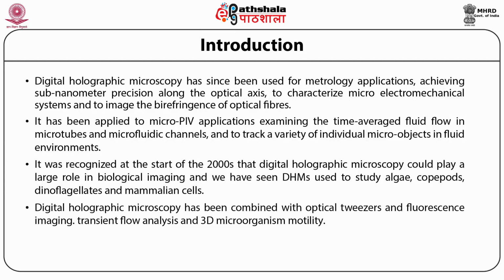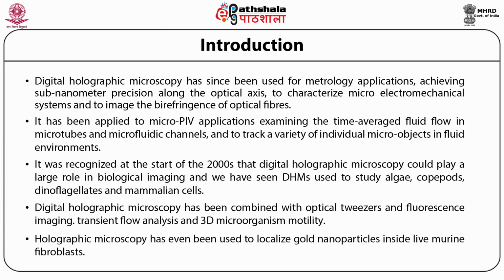Digital holographic microscopy has been combined with optical tweezers and fluorescence imaging. Holographic microscopy has even been used to localize gold nanoparticles inside live murine fibroblasts.